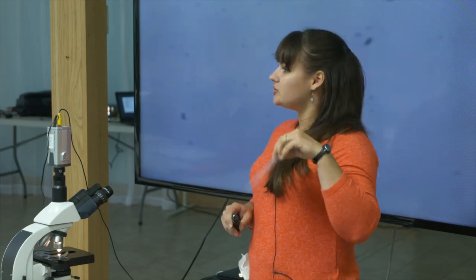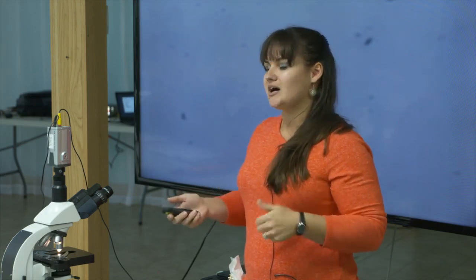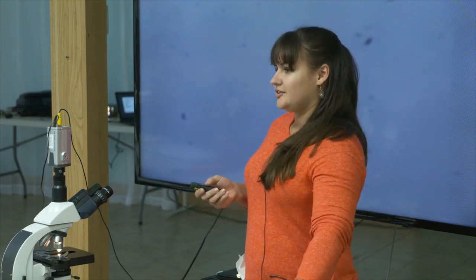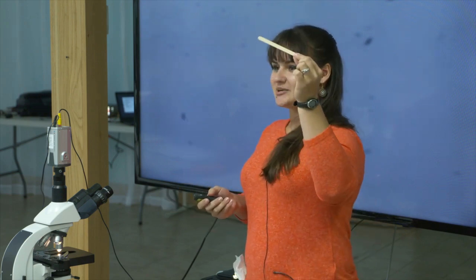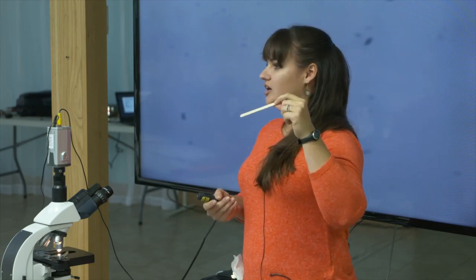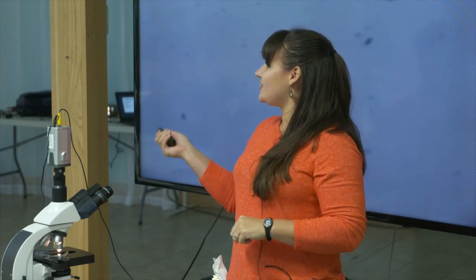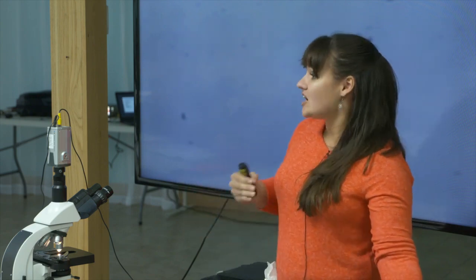Plastic droppers — single-use, you can get them on Amazon usually in groups of hundreds for about ten bucks — work great. As long as you've got some kind of dropper that you can wash out thoroughly, you're good to go. We have glass reusable ones in our lab. For stir sticks, we take craft sticks, cut them in half, and we're good to go. This is going to break up the fecal manure and get it to the strainer without you having to touch it.